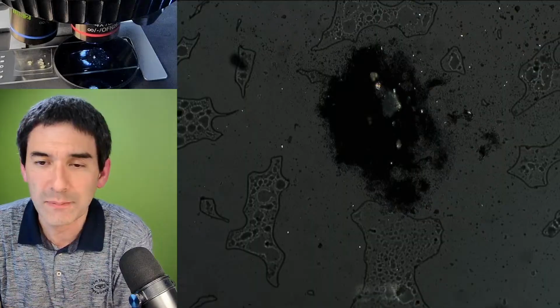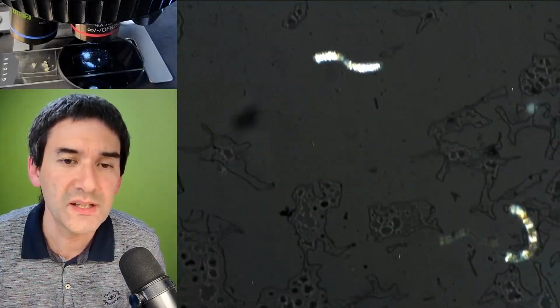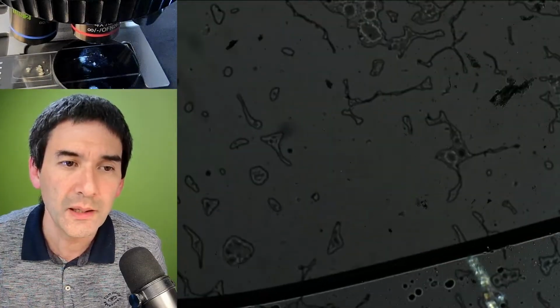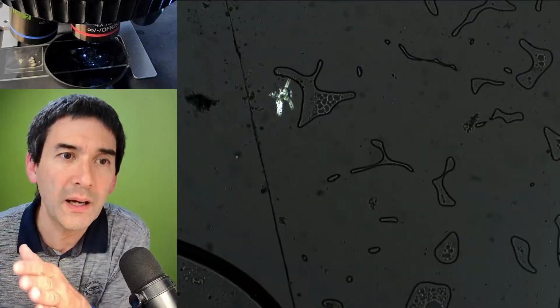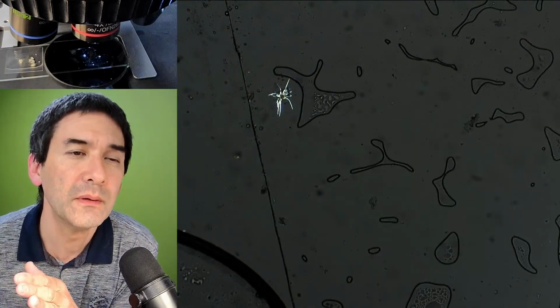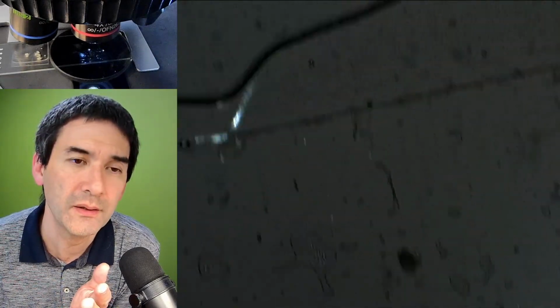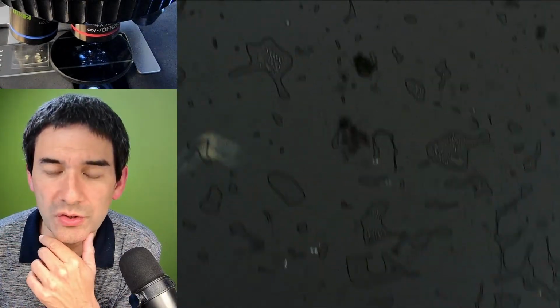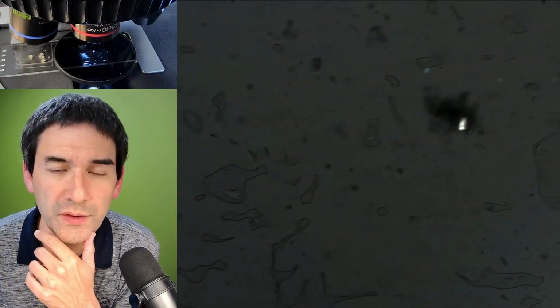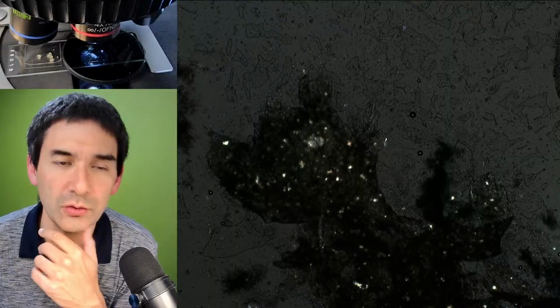Yeah, so this is a little bit the thing here, and what we see here is that some of those structures could either be polarizing by turning the light, and then you see it, or by simply depolarizing it. Here again, a trichome. Yeah, most possibly maybe from my here again over here. So basically it's something I just wanted to also share with you, also as a possible thing to try out.